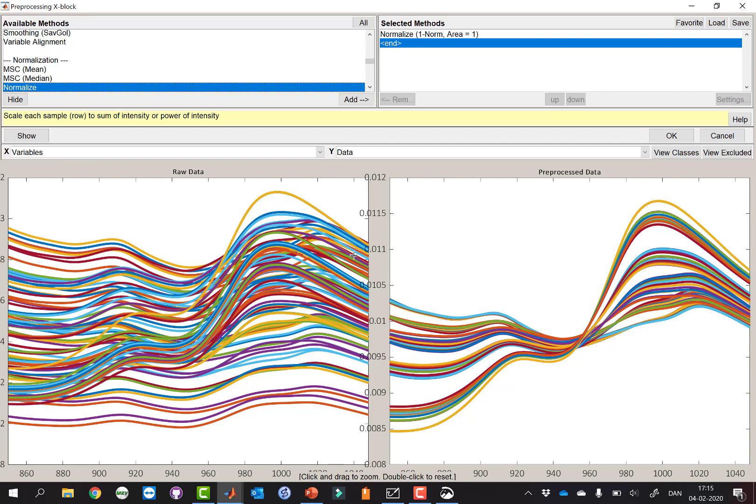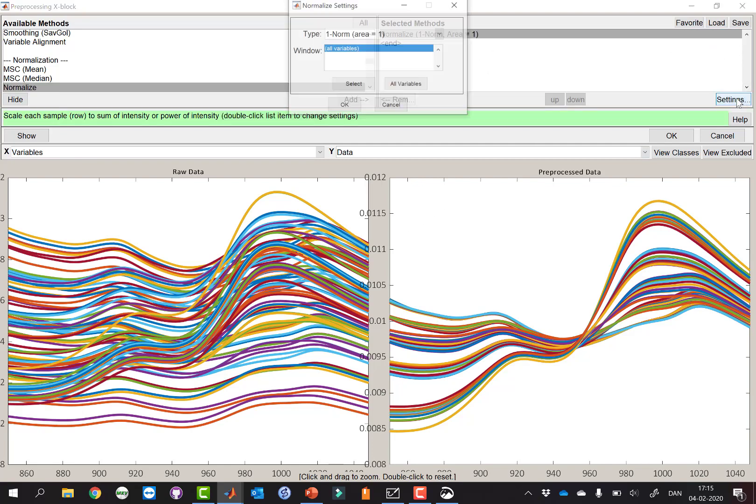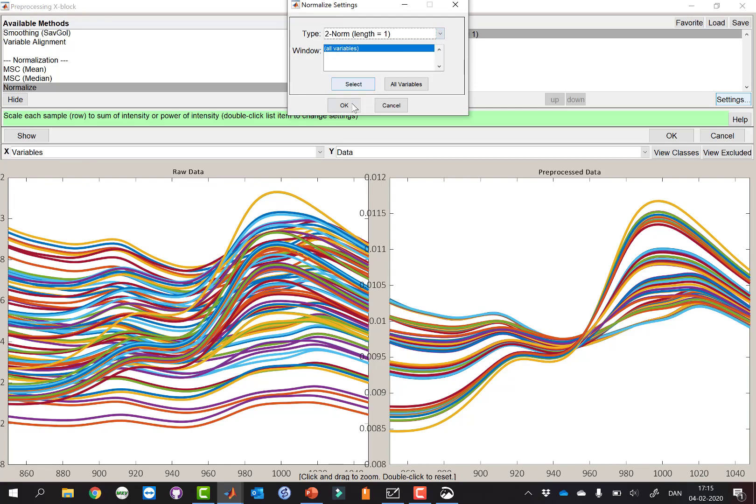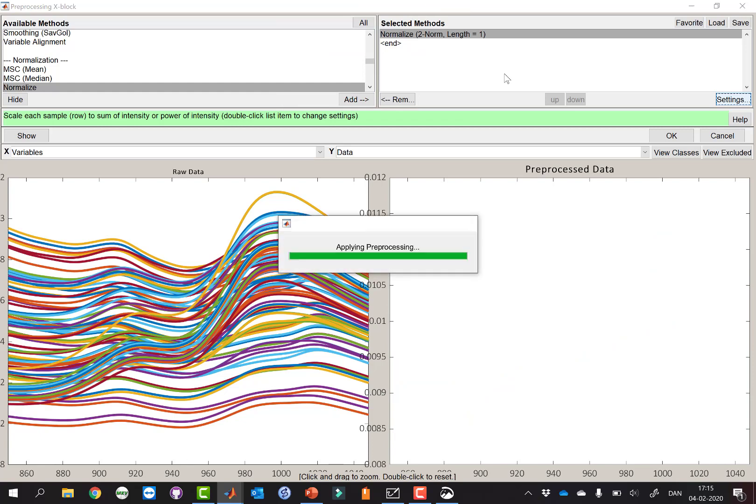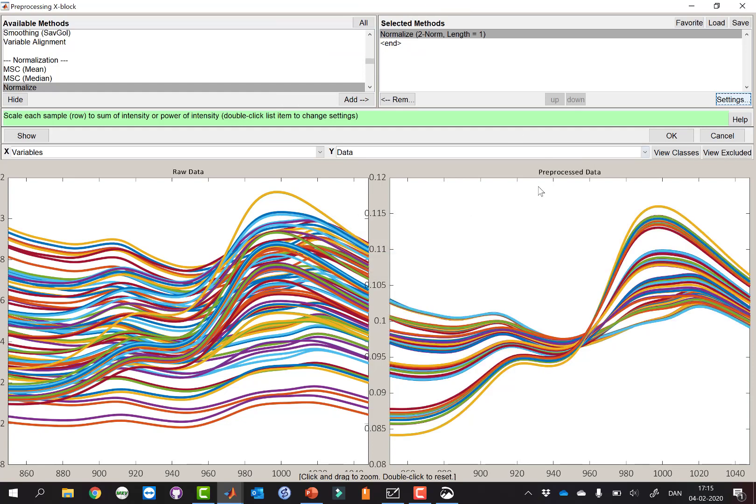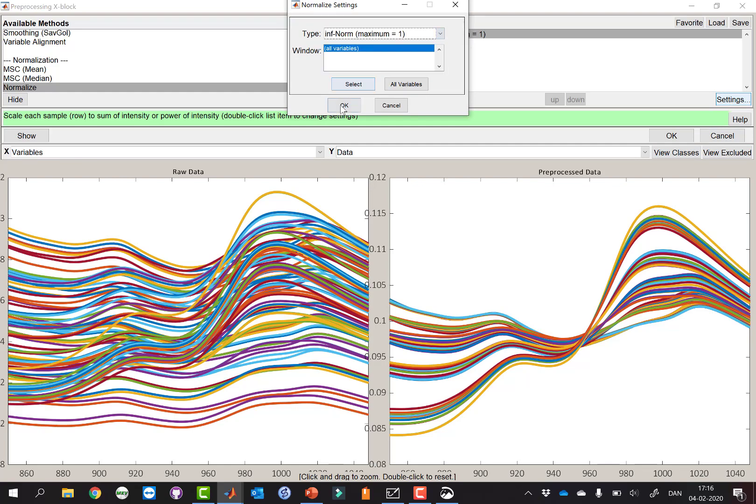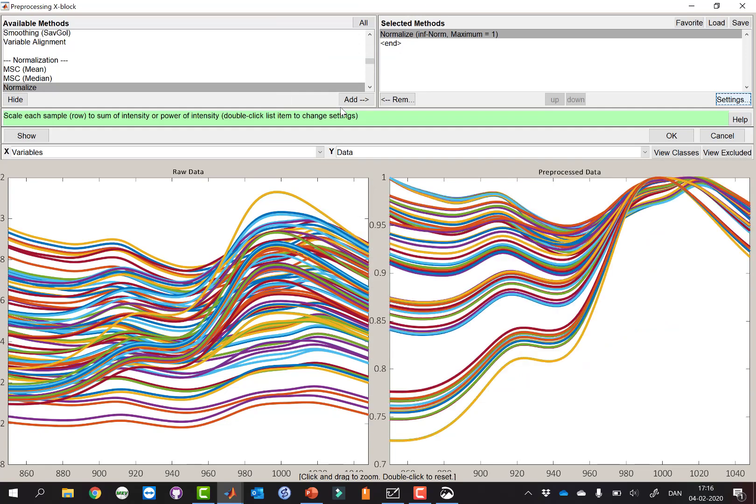Now we can also try and change this, for example, to a two-norm like this, and we'll see that that's more or less giving us a similar quality. It's not exactly the same, but it's similar.